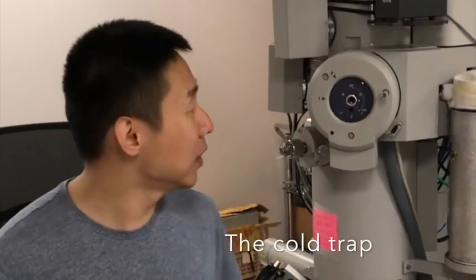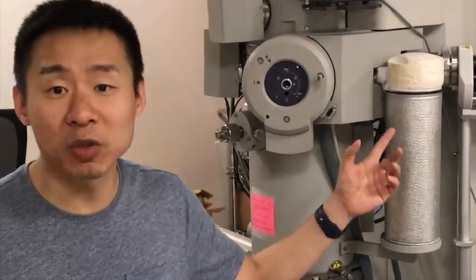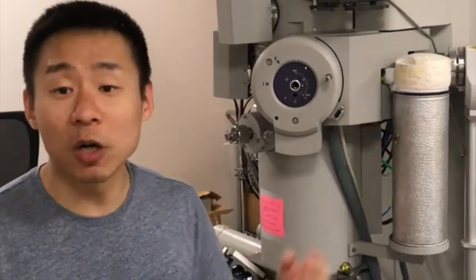This demonstration is assisted by my PhD students, Dvijan Yadav and Dxing Zhang. The first thing we want to talk about is the cold trap. Before any TEM session, we want to make sure that the cold trap is filled with liquid nitrogen. The aim of having the cold trap is to improve the vacuum of the column.